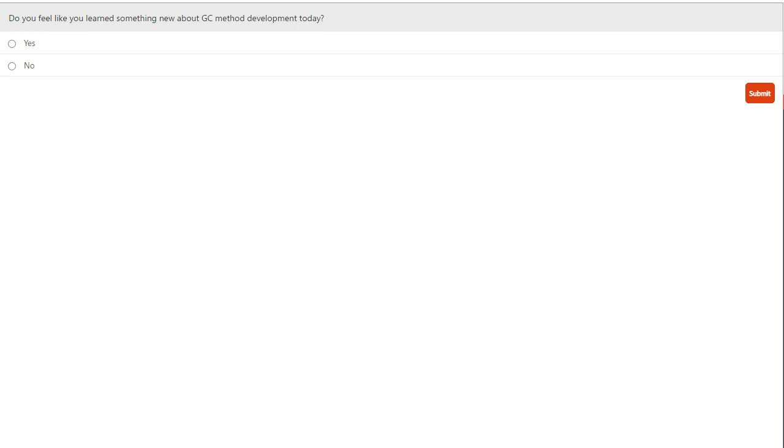Thank you. Next question: when would a standard GC method be more appropriate over a fast GC method? This is an interesting one, because the trivial response is, why would you want to go slower? But when we look at this in more detail, we need to consider the physical constraints that we have with the system as well.